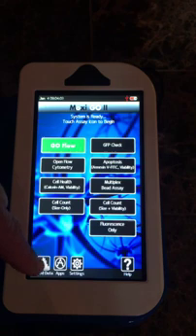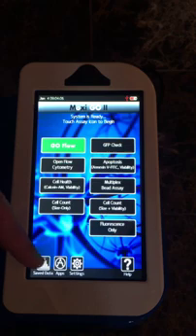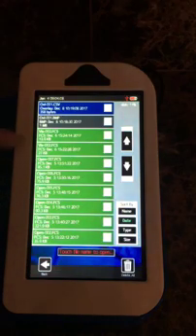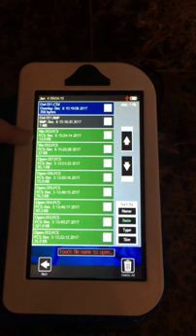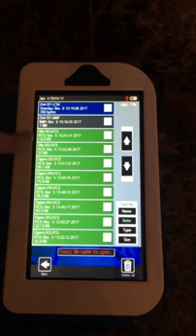All the tests get stored on board — we store about 100 tests. If you click on the save data icon down here, you'll see that we color-code our files. Green is our FCS format, which is the standard file format, so you can open it in any standard flow analysis package such as FlowJo or FCS Express.